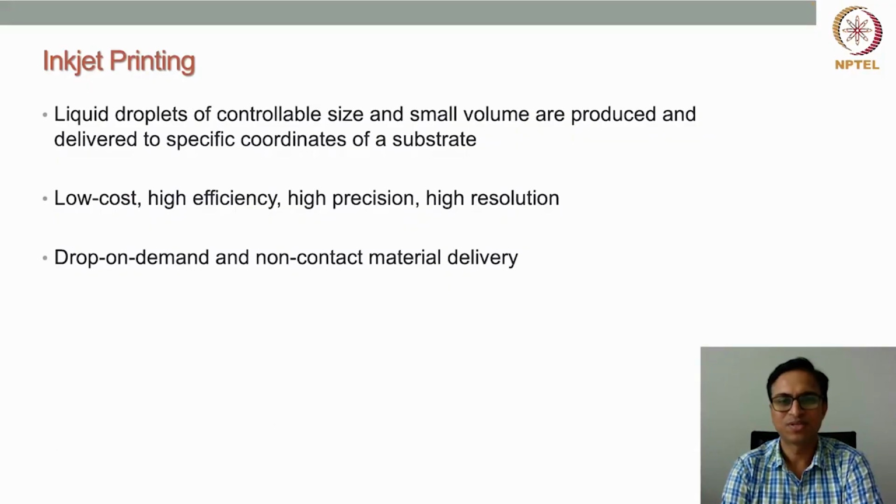Hello students, welcome to the course of organ printing. So till now we have discussed what is bioprinting, what are the different types of bioprinting techniques available. So in this lecture we'll discuss inkjet printing technology or inkjet 3D bioprinting technology. So inkjet printing is a very common technology that in most of our offices we have printers, where some of the printers work on this inkjet principle.